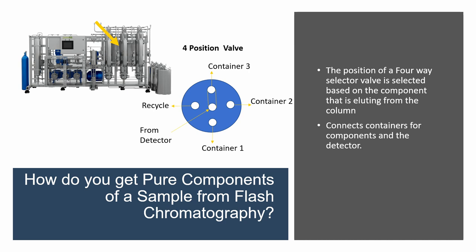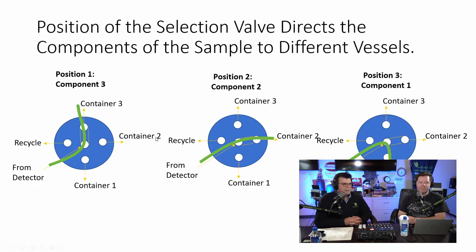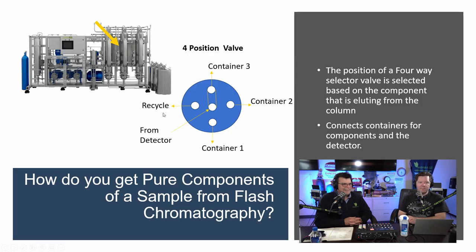Okay, so how do you get pure components of a sample from flash chromatography? Now, this is where the selection takes place, right? The detector now is going to say, hey, the blue component is coming through. How does it actually do that? It uses this valve here. You can see this valve is connecting the fluid that's coming from this detector here, and then it's connecting it to these different containers.